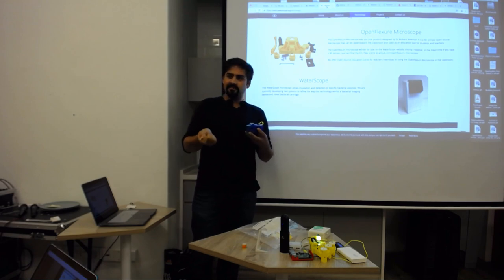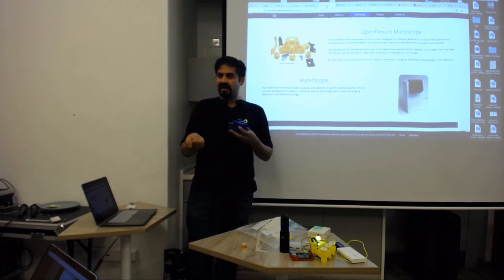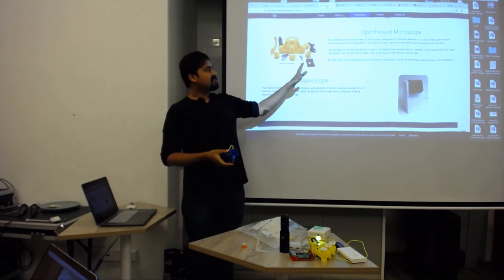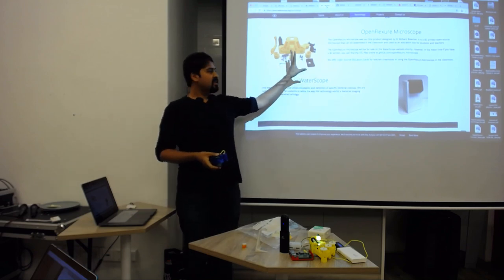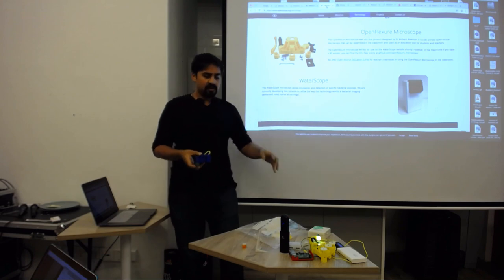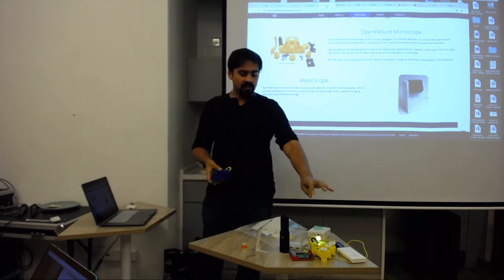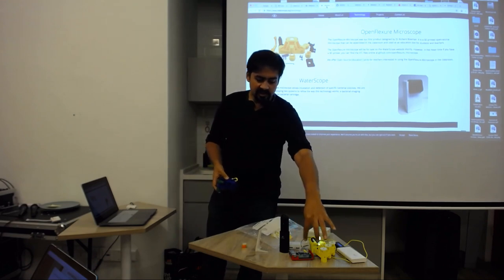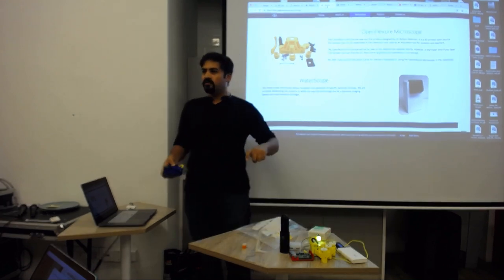But you still needed to plug it into a computer. You needed a USB cable or whatever, and plug it into your laptop and then see it. What these guys did was that they took this design, they shrunk it down a little bit, made it work with a Raspberry Pi. So what I'm going to show you later on is this working, but this is a Raspberry Pi. Who hasn't seen one before?